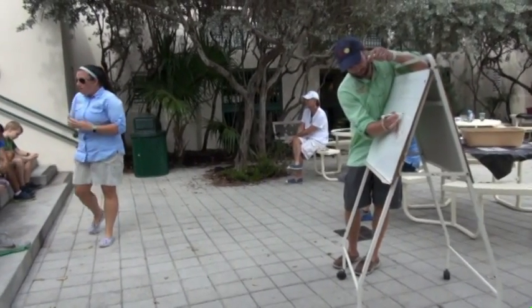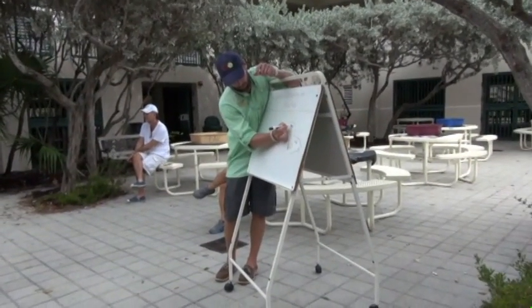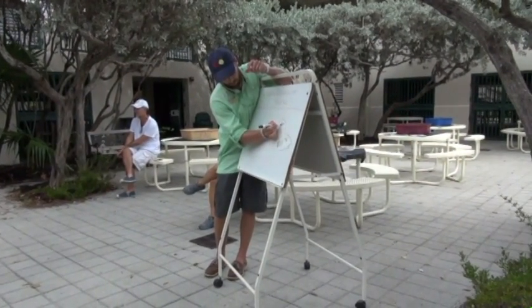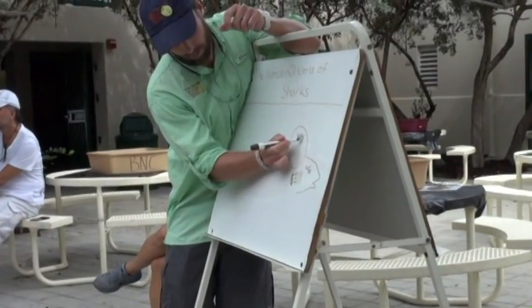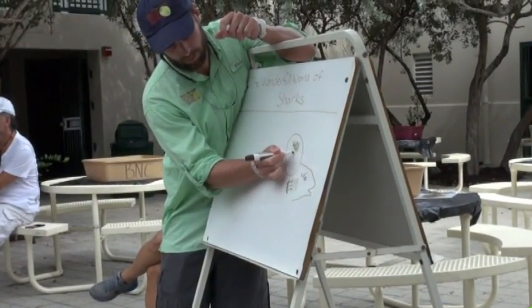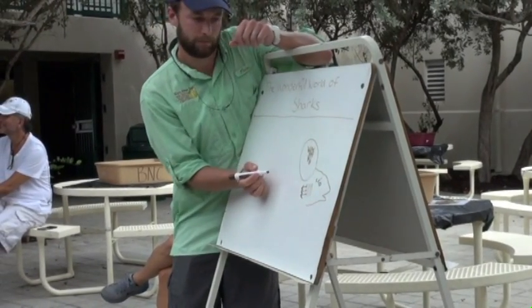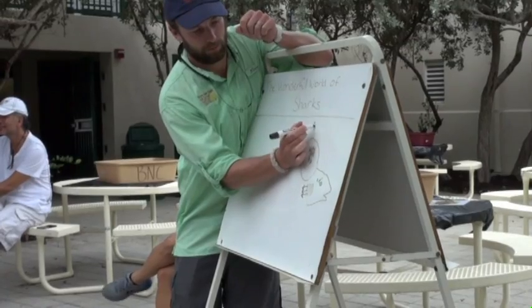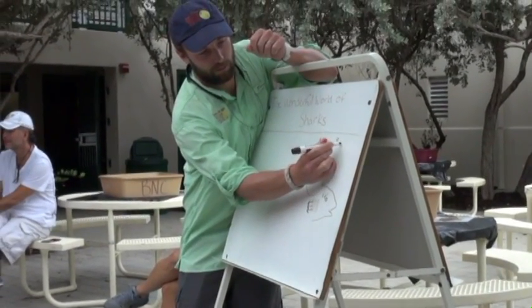on the shark scale. The shark scale is really cool. It's called the placoid scale. If you guys have ever heard of placoid, it sounds really familiar to the word plaque. Here's a plaque before. How many guys have been to a dentist before? What does a dentist scrape off your teeth if you don't brush them a lot? Plaque. Yes.